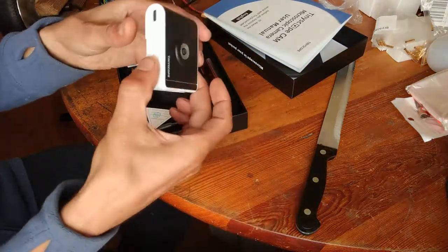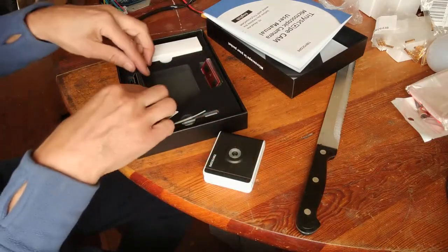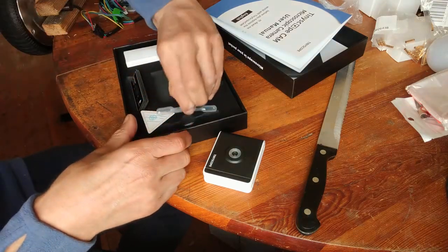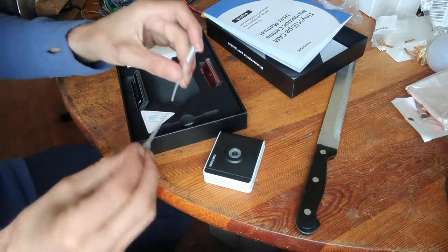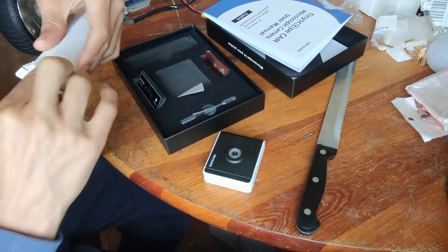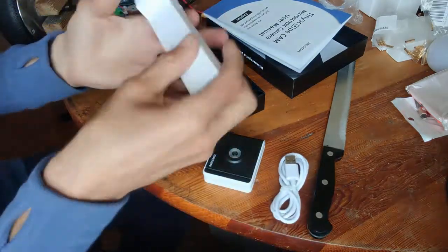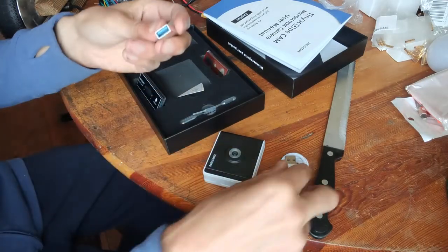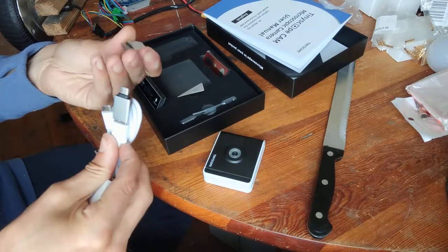Okay, what do we have here — this is the TinyScope, and it uses USB-C, which is already nice. No old micro USB. We have some kind of pipette or liquid sampler. I'll test it later — this is just the unboxing. And here we have a USB-C cable and some nice adapters.